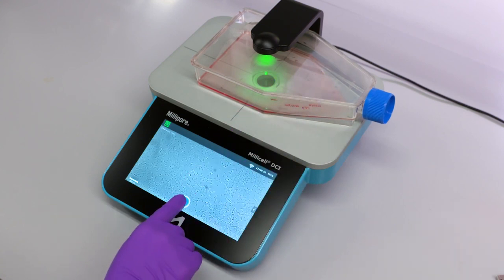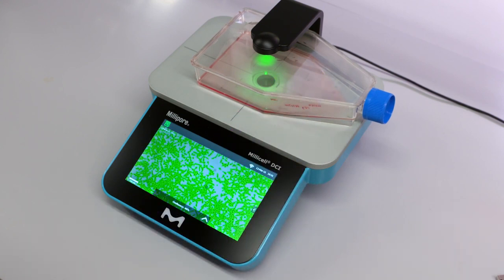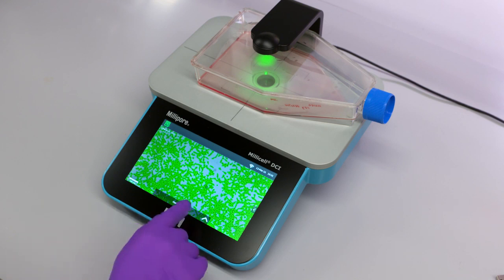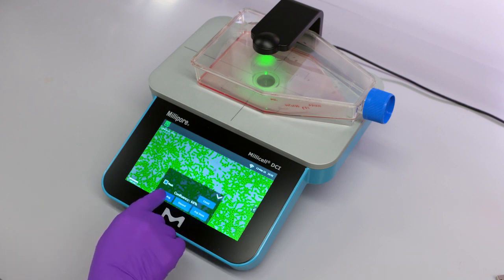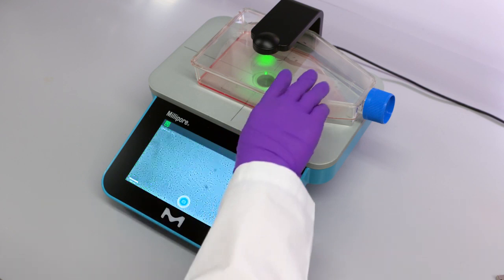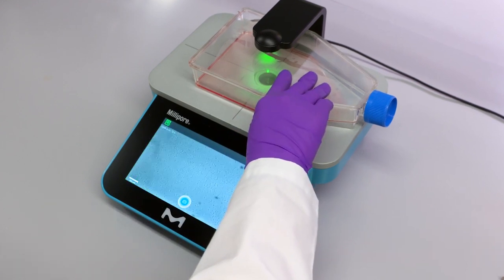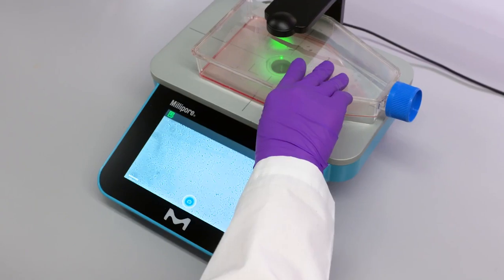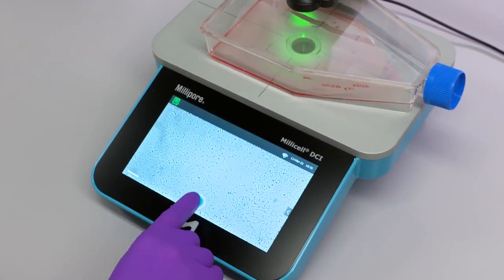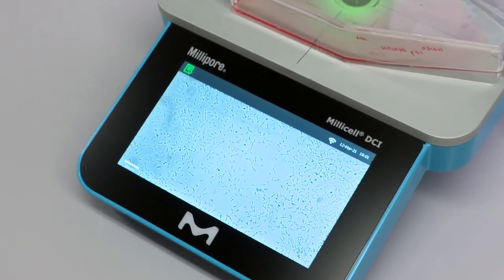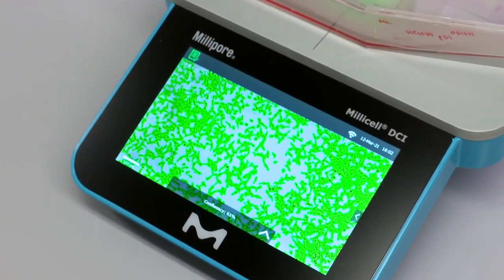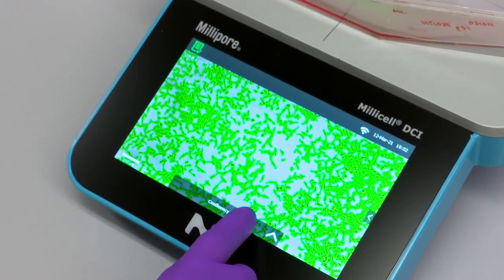The updated average is displayed on the upper left-hand corner next to a green checkmark. Once the average is complete, click either the green checkmark or average done.